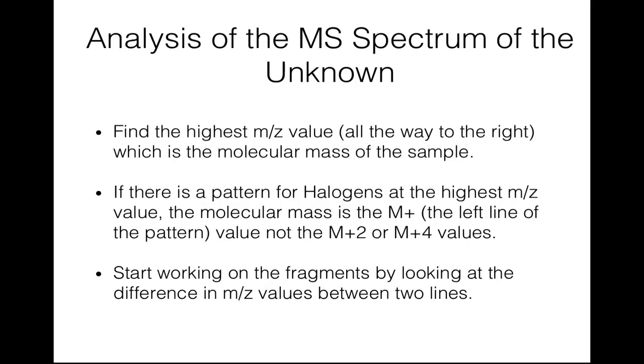To analyze your unknown samples, we have provided the mass spectrum for each unknown. From the spectrum, you can determine the molecular mass of your sample, identify the presence of halogen by looking at the isotope patterns, and then figure out the possible fragments from your unknown molecule. This information will supplement your IR and HNMR spectra, obtained in the previous experiment. Using all these three analyses, you can finally decide the correct structure of your unknown.